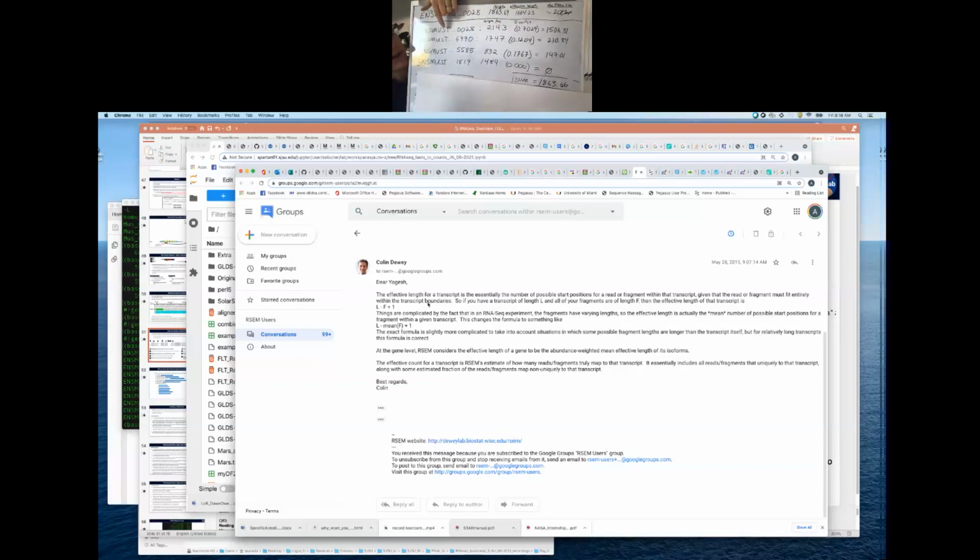But then these other isoforms here, they are splice isoforms, right? So each one of these has fewer exons than the total number of exons possible, which is the number of exons expressed in this transcript. And so that's why you see that this transcript here has some exons spliced out. I'm not sure how many, but ultimately once those exons are spliced out, we're left with this length for this transcript. And then in this transcript here, we have even more.